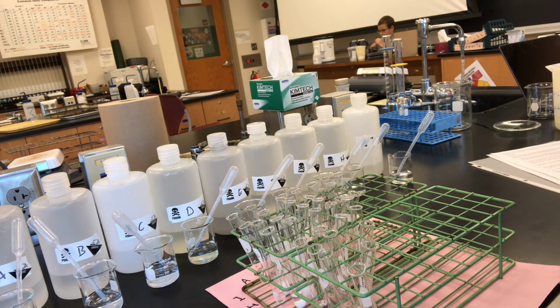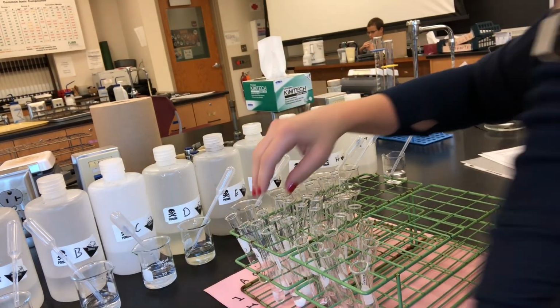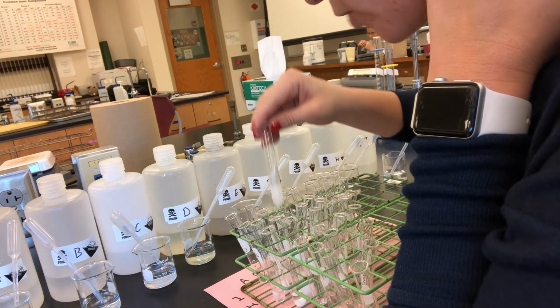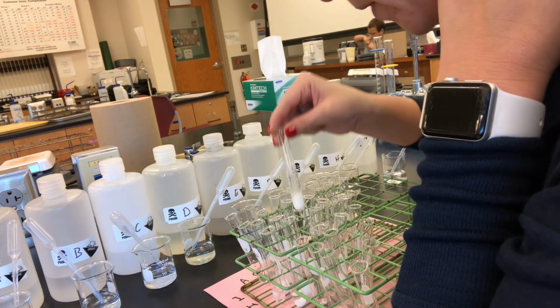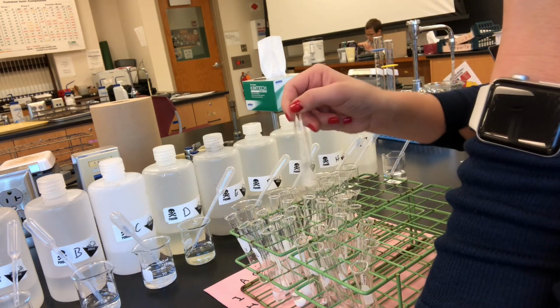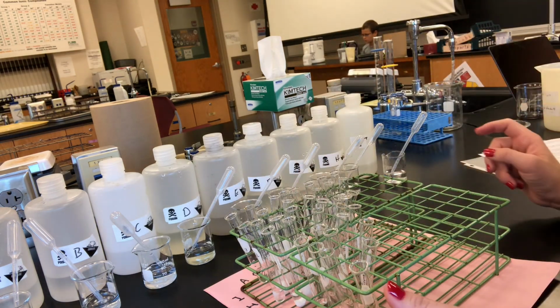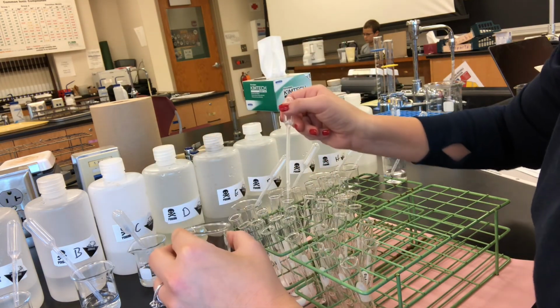All right, let's see. Double check my recap. Oops, bumped my camera. C and H gave a precipitate. C and G formed that milky precipitate. And C and F. Okay? All right, next row, or next column, excuse me, is D.